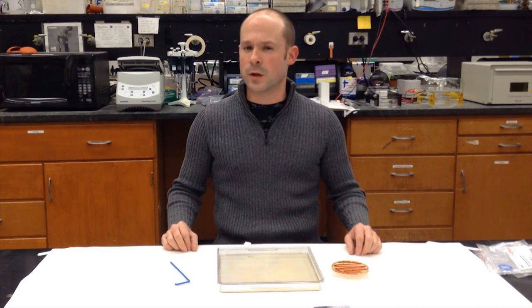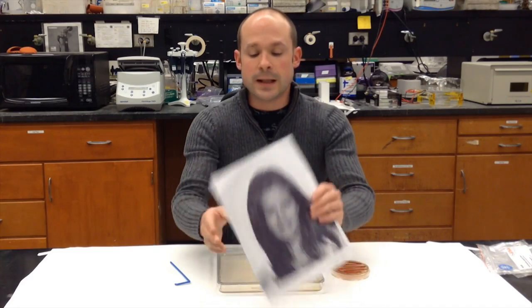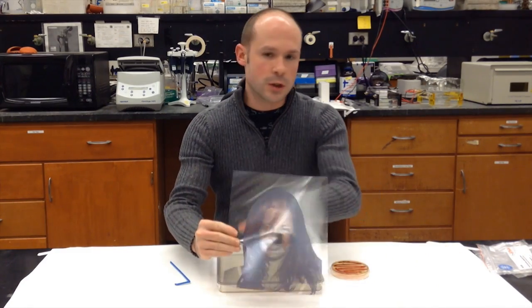Now, this halftone is important because I use it to make a special negative. That part of the process I keep secret, but just to give you an idea of how to visualize what the negative is, think of it as that halftone image made of dots, printed on a clear transparency, so you can see right through it.